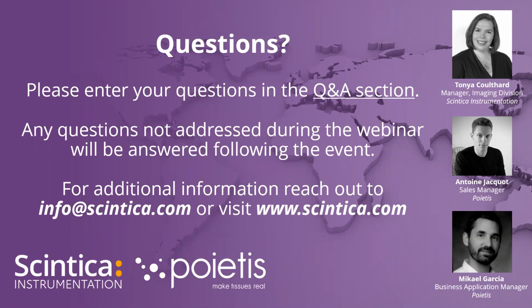But if we want to work with, say, 96 well plates, for example, we'd have to print cells from a bit further away. And so we're currently in the process of evaluating whether this distance would have an impact on precision and resolution. So we're pretty confident that we will at some point be able to open it up to 96 well plates.